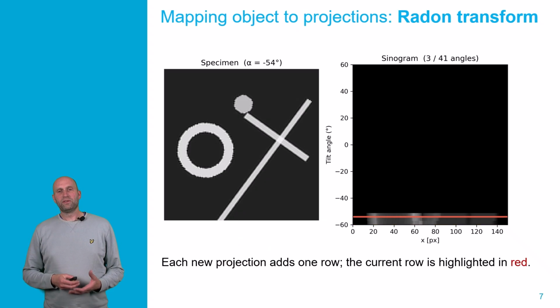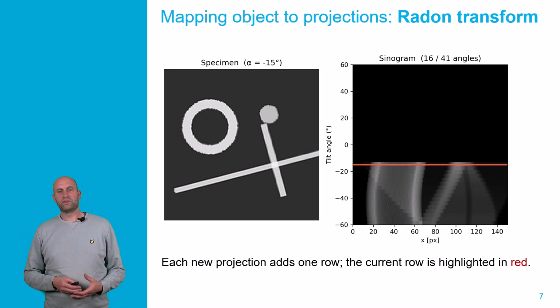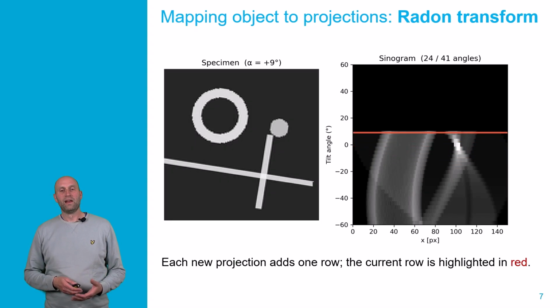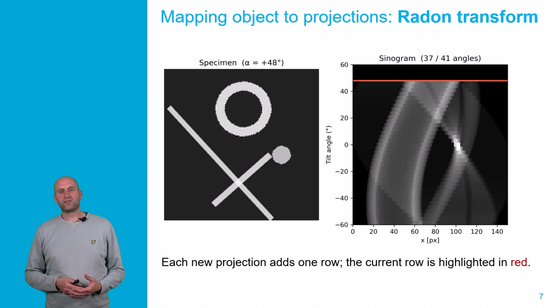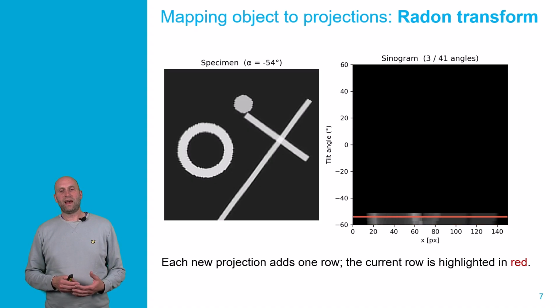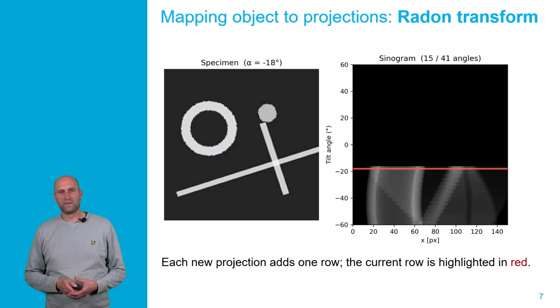Now, we can make use of that fact and then construct something that we call a sinogram, that is essentially a radon transform of all the projections that we can obtain from our object of interest. You can see in that animation, as we are tilting our image, each of these tilted images gives us a unique projection that we can add into our sinogram at the relative orientation under which we have observed this projection.